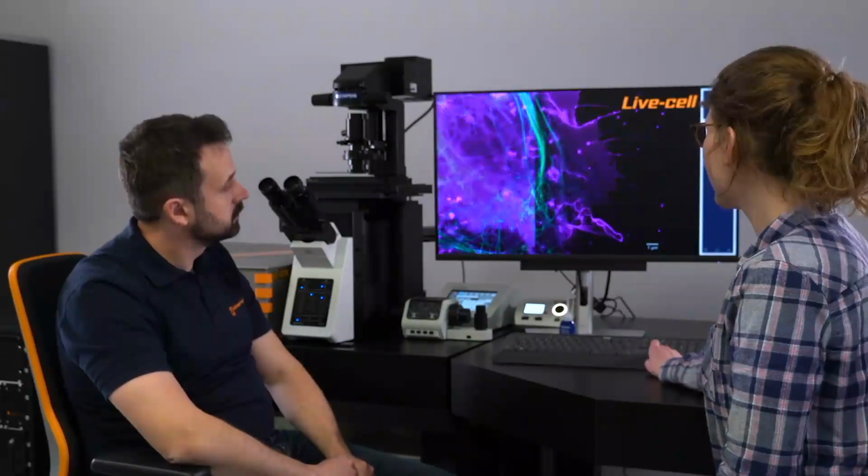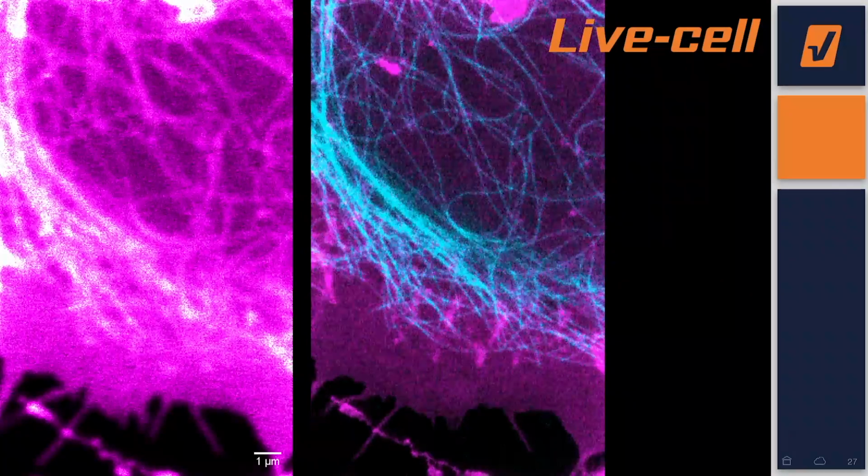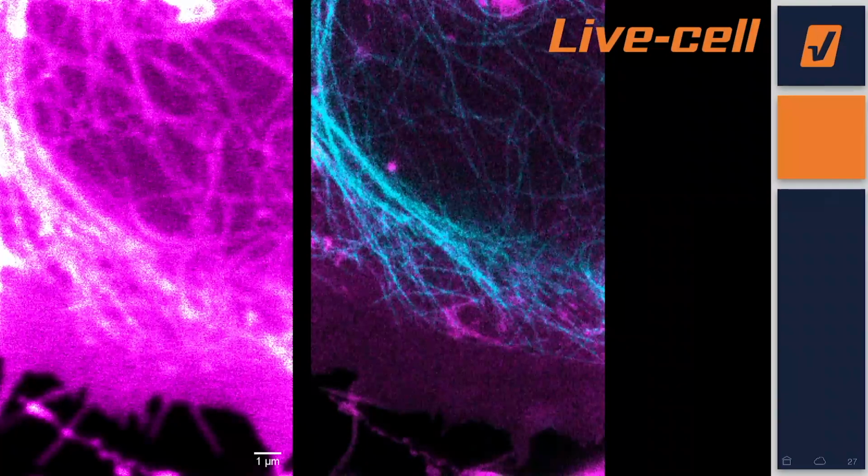Yes, and because it's such a nice cell, I also did a time lapse from these cells. So that's right now here. First the confocal, and right here the STED image. And we can nicely see moving around the tubulin and the membrane stain in this movie right here. I hope today we were able to convince you of the benefits of TIMEBOW for lifetime imaging.